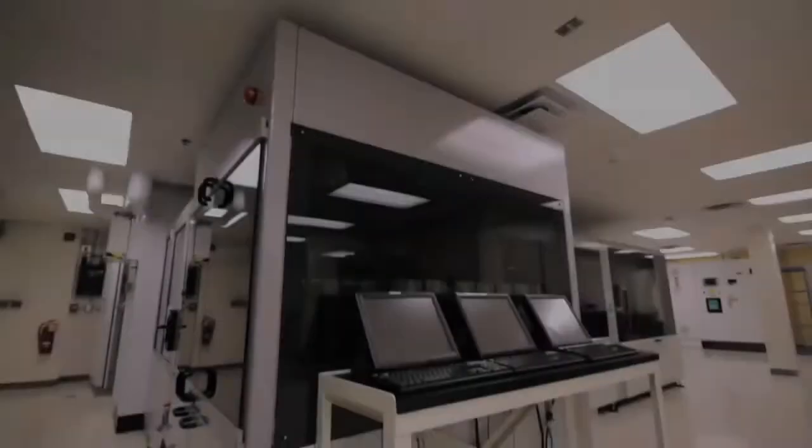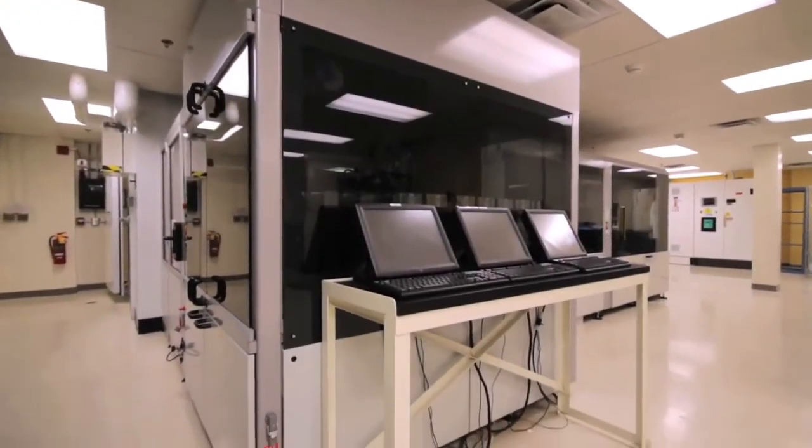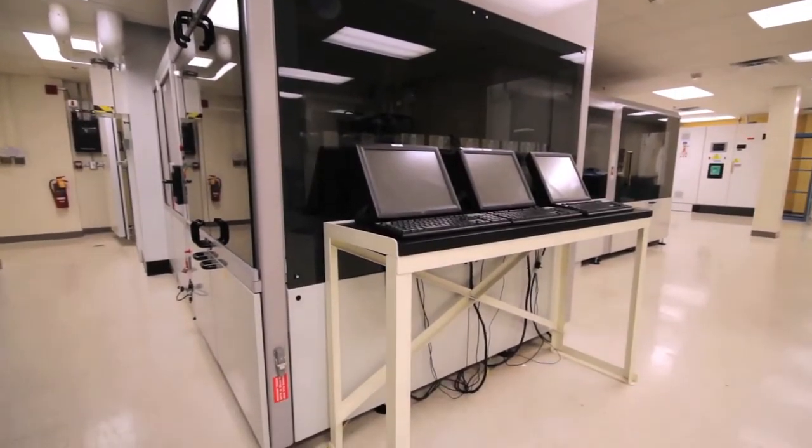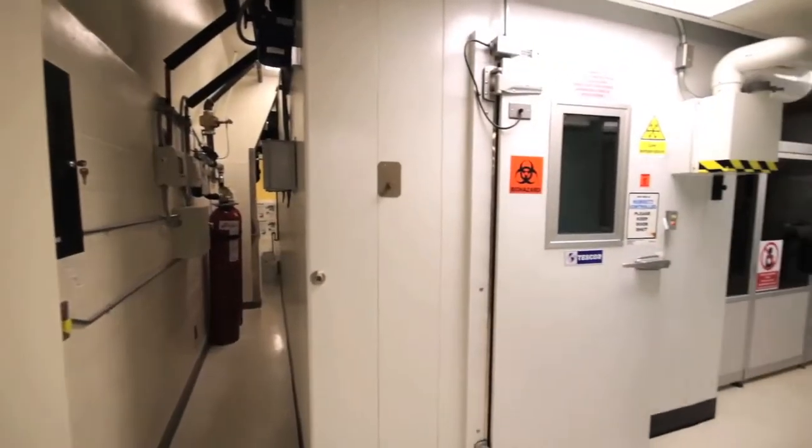In 2006, the Automation Partnership, also known as TAP, configured and installed the solar dizygotic system at this current client location.